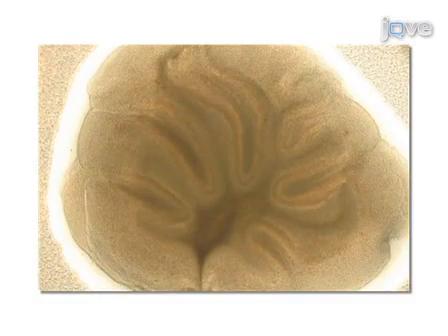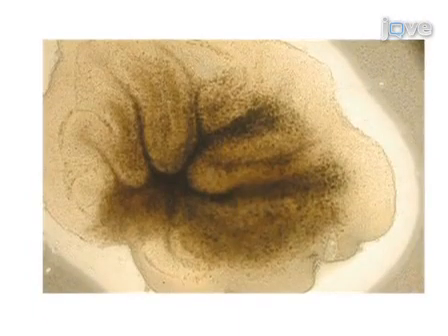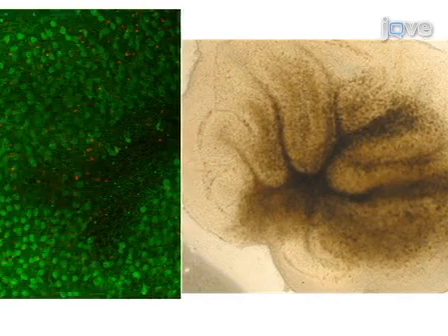This image shows a healthy cerebellar slice after 2 days in vitro. The cell body layer appears translucent and the foliated structure of the cerebellum is clearly seen under the microscope. After 7 days in vitro, the foliated structure of the healthy cerebellar slice is still visible. In addition, dark cell bodies, probably macrophages, usually cover the slice.